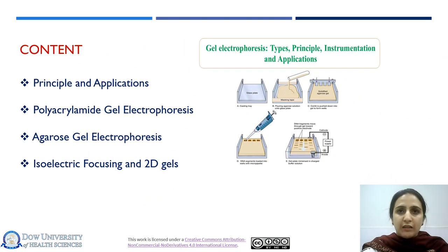In today's lecture, I will be discussing the principle and application of electrophoresis, followed by the different types of electrophoresis commonly used, in which polyacrylamide gel electrophoresis, its types, and agarose gel electrophoresis. And in the end, I will discuss briefly isoelectric focusing and two-dimensional gel electrophoresis.